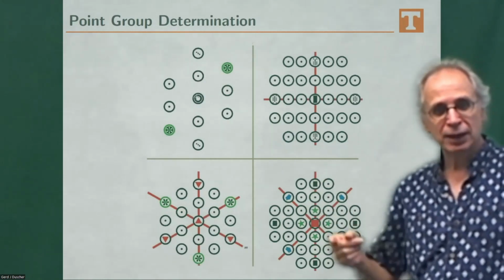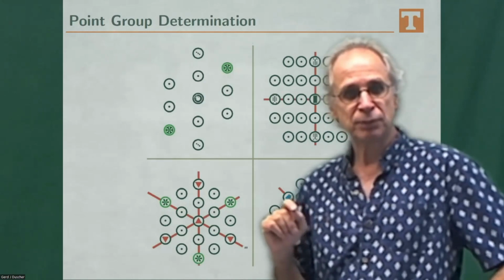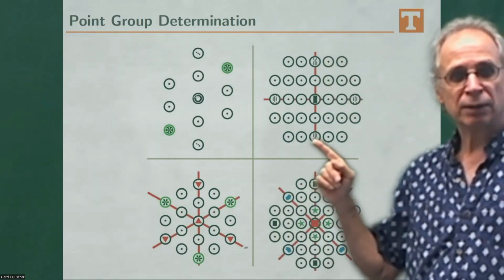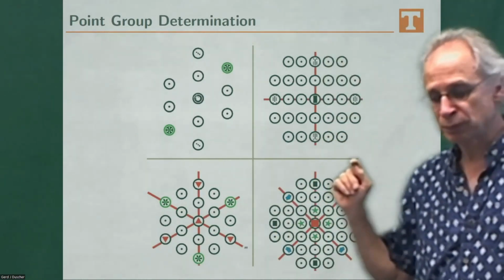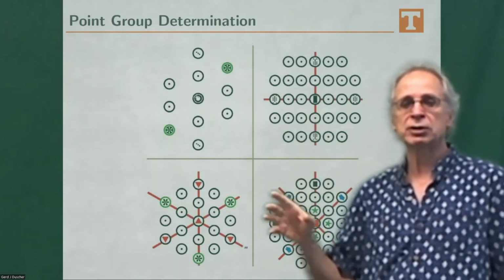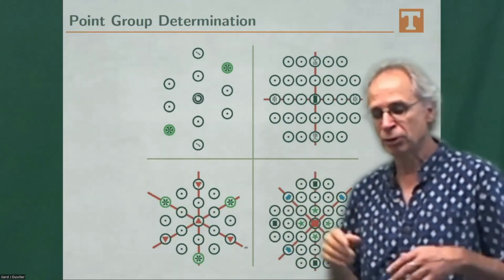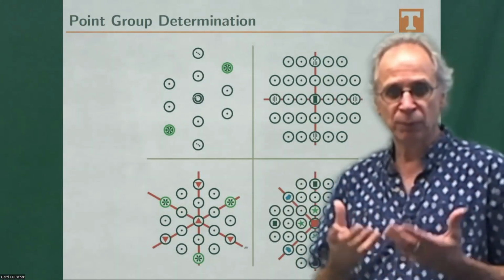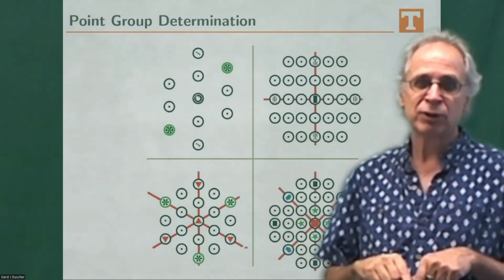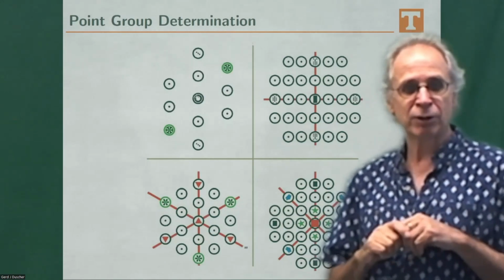While the mirror symmetries might be giving you two-fold and four-fold mirror symmetries or three-fold, they would be all the same for you. Now that you have structure in your spots, that doesn't look like that anymore.